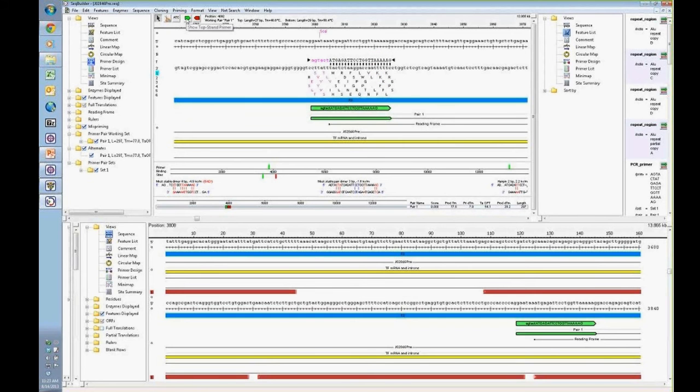So let's first work on the 5' end. Previously, I do know that we want to start with the GCC, so we're going to drag this out to right about here. And then at the 3' end of this target, I'm going to drag this down to the AGAT, which is right about here. And as you can see here, that manipulation has resolved those false binding sites across that template. And then I'm getting some better results in regards to the stable dimer formation, the hairpin information, and the possibility that the primer may bind to the bottom strand.